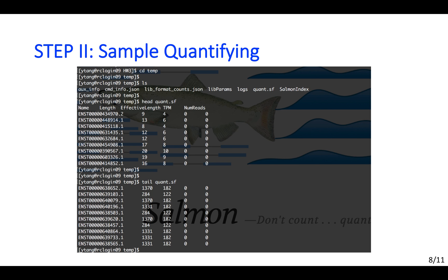Let's take a look at the output. Move to your path to the output file. The main result is stored in the quant.sf file. You could find the names for the transcript terms in this file. This file also contains the original length, effective length, TPM, and number of reads.